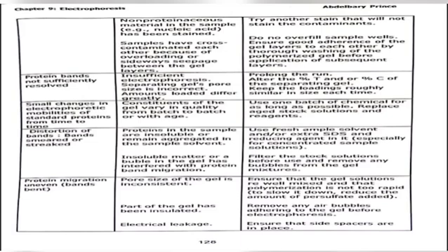Problem: distortion of bands, smeared or streaked. Cause: proteins in the sample are insoluble or remain aggregated in the sample solvent. Remedy: use fresh sample solvent and/or extra SDS and reducing agent in it, especially for concentrated sample solutions. Cause: insoluble matter or a bubble in the gel has interfered with protein band migration. Remedy: filter the stock solutions before use and remove any bubbles from the gel mixture.